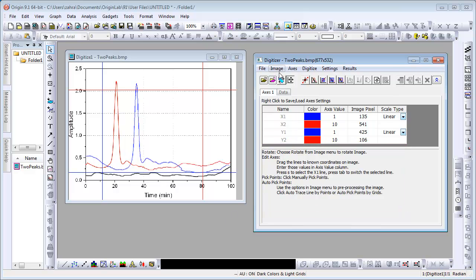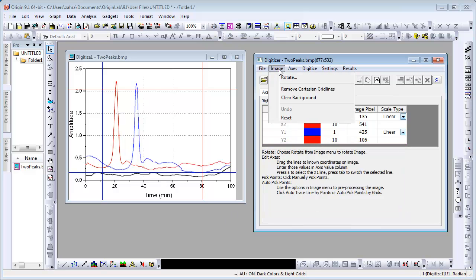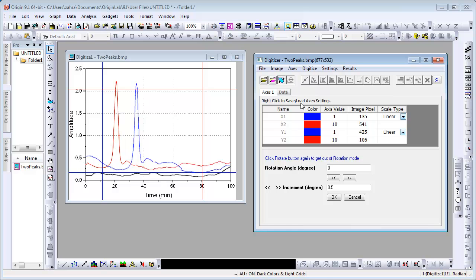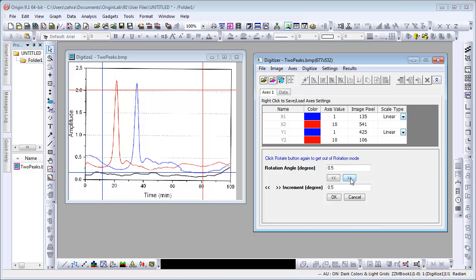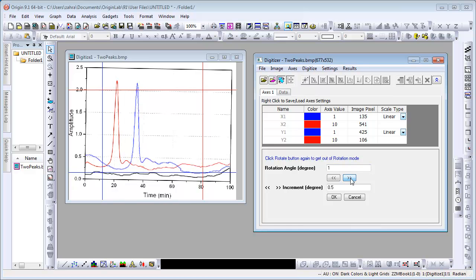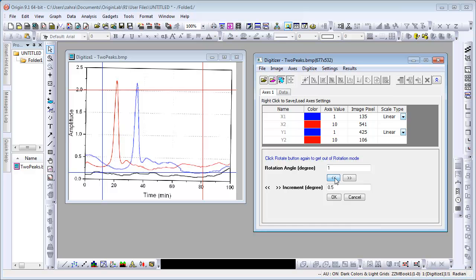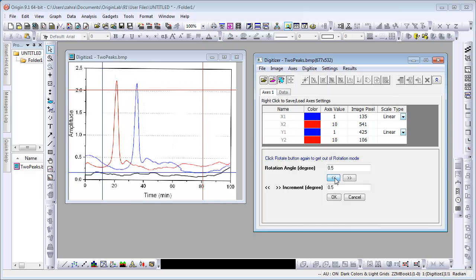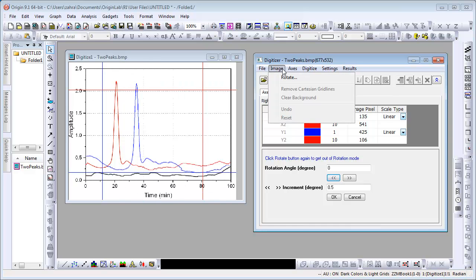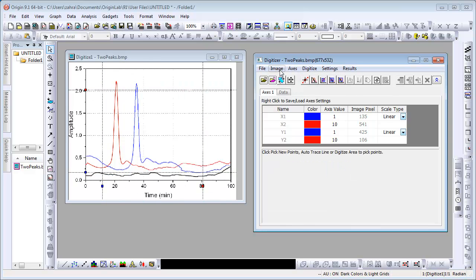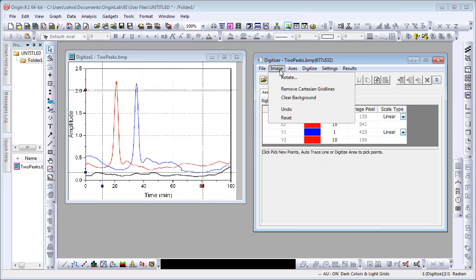Use the Rotate option under the Image submenu if the image is not aligned correctly. Change the rotation as desired using these arrow buttons. You can also clear Cartesian gridlines and clean up background noise under the same submenu. Here we will clean up the background.